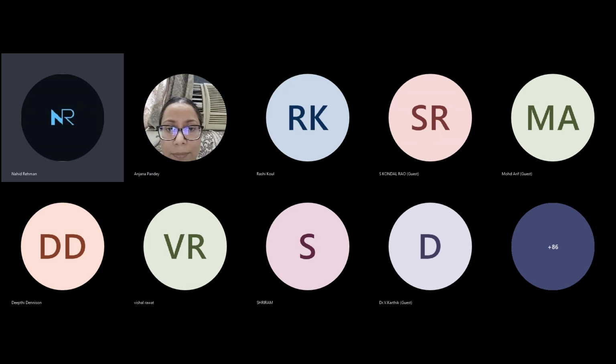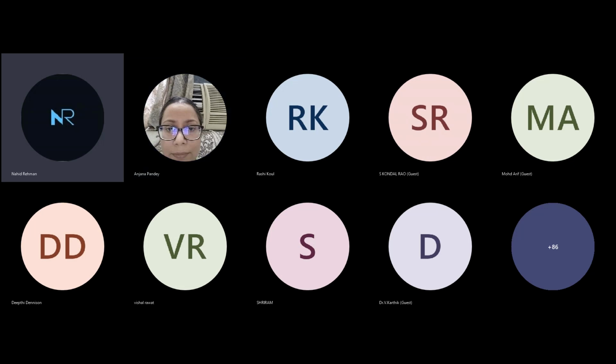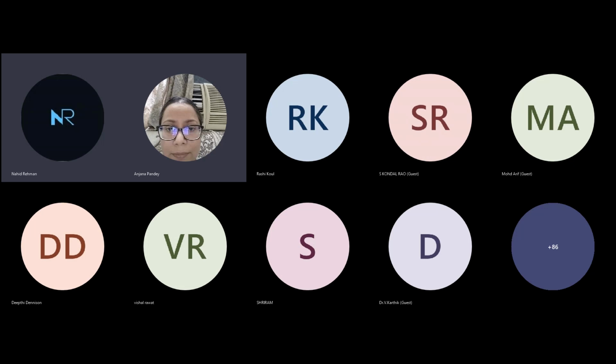Ma'am, if we are planning for a larger scale, let's say around 1000 liter, for an integration process like an algal system and microbial system for the production, what design should we keep in mind while designing the reactor? Okay. You wanted to produce biodiesel? What do you want? Biohydrogen integrated. The biohydrogen products. Then why don't you extract oil from the algae also?